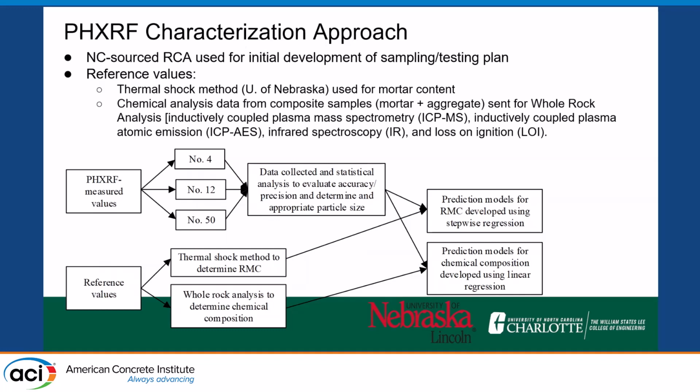We also used a geochemical analysis method that's common in the mining and other mineral industries, called whole rock analysis. Whole rock analysis includes all sorts of approaches. It uses ICP and mass spectroscopy, a series of tests that is essentially a chemical characterization of the rock, but they pulverize it. So we sent samples to a lab for that full geochemical analysis, and that served as our reference.